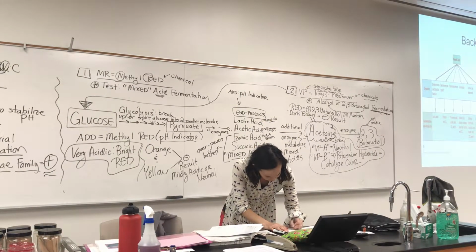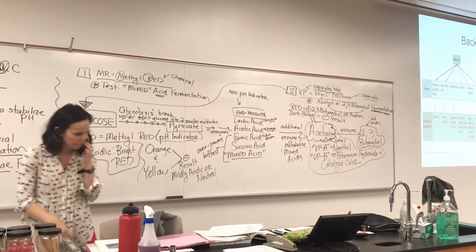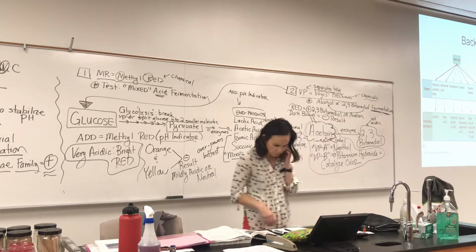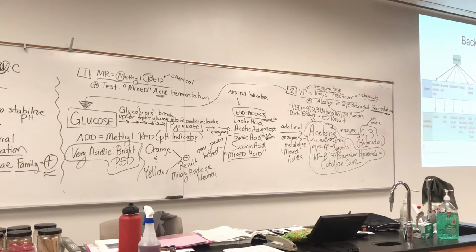Technically, yeah, you're right, because if it doesn't break down glucose, then you won't get pyruvate, right? Yeah. That's why I was asking if it's like a reduction where if that's negative then we have to do that one.